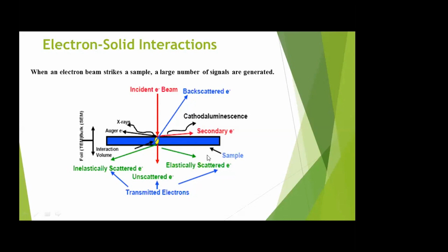In simplest terms, when you have a particle beam like this falling on the specimen and it passes through it, whatever kinetic energy is present in the incident beam, the same is preserved in the scattered beam also, but its direction of propagation is changed. That is elastic scattering.